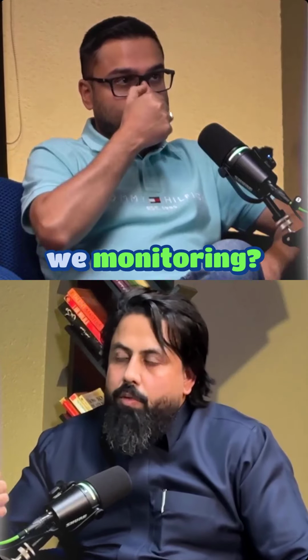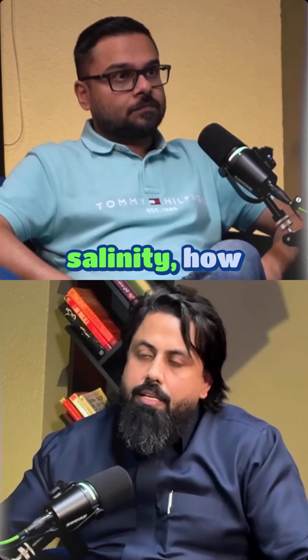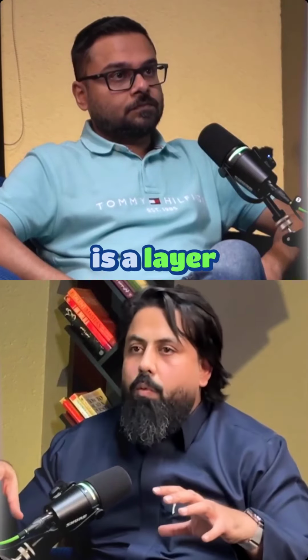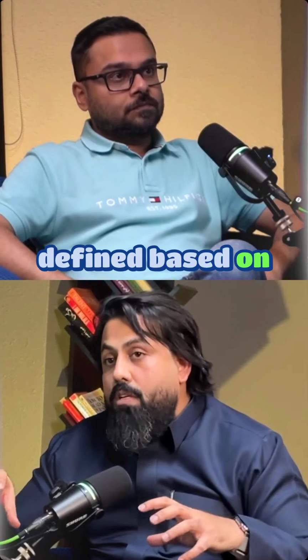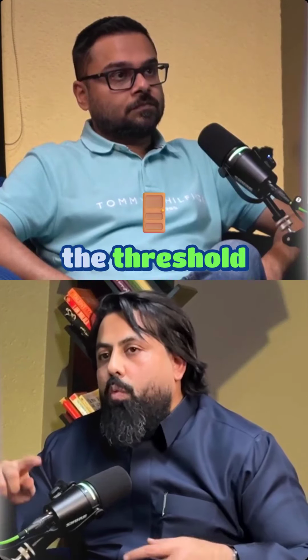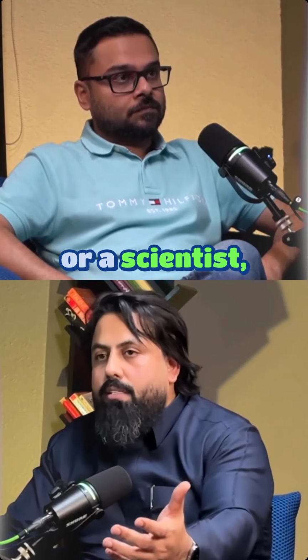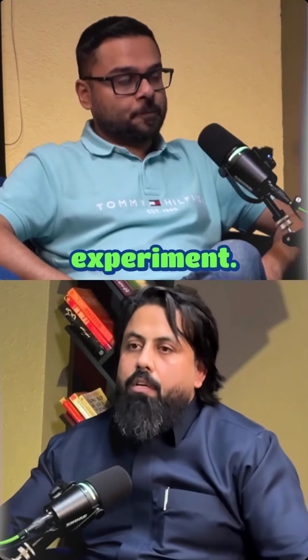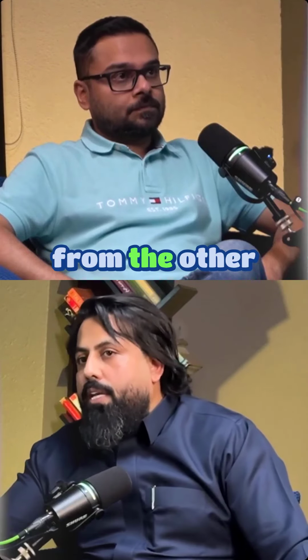So what are we monitoring? We're monitoring dissolved oxygen, salinity, and how exactly the pumps are functioning. And on top of it, there is a layer which is defined based on different experimental individuals' thresholds. As somebody who's doing research, or a scientist, you want conditions to be based on your condition, as in the experiment. So your criteria can be different from the other criteria.